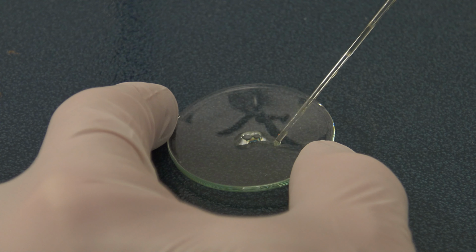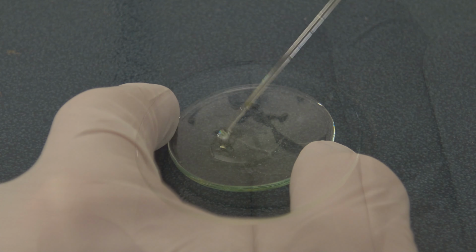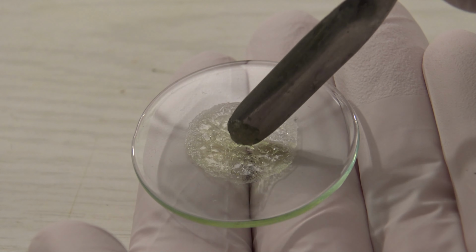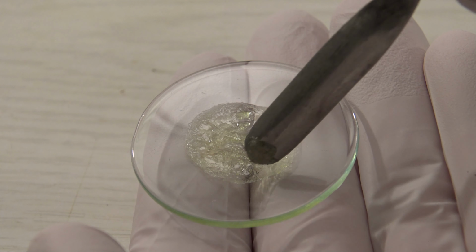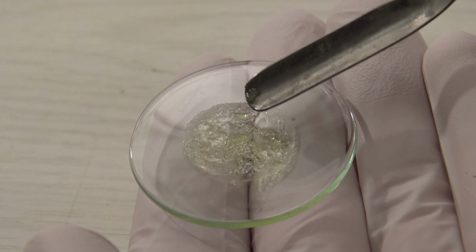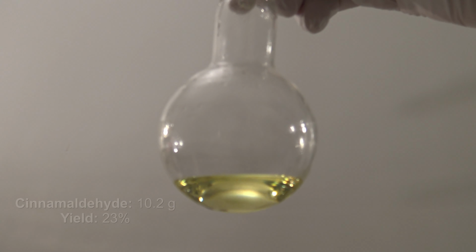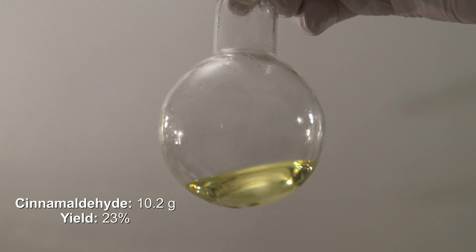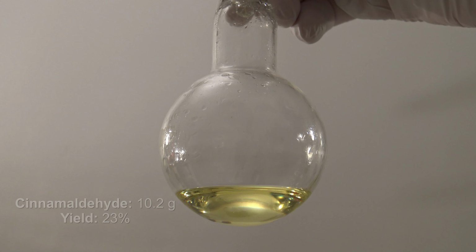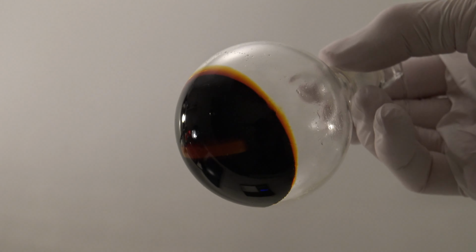In the end, a small sample was added to a watch glass and left to sit for a few days. If it was cinnamaldehyde, it could be oxidized to cinnamic acid, which is solid. Interestingly, the oxidized sample had a way more natural smell because cinnamic acid is one of the other compounds in cinnamon. 10.2 grams of cinnamaldehyde were obtained, which corresponds to a yield of 23%. The low yield might be due to a lot of side reactions, which can be seen by the residue in the distilling flask.